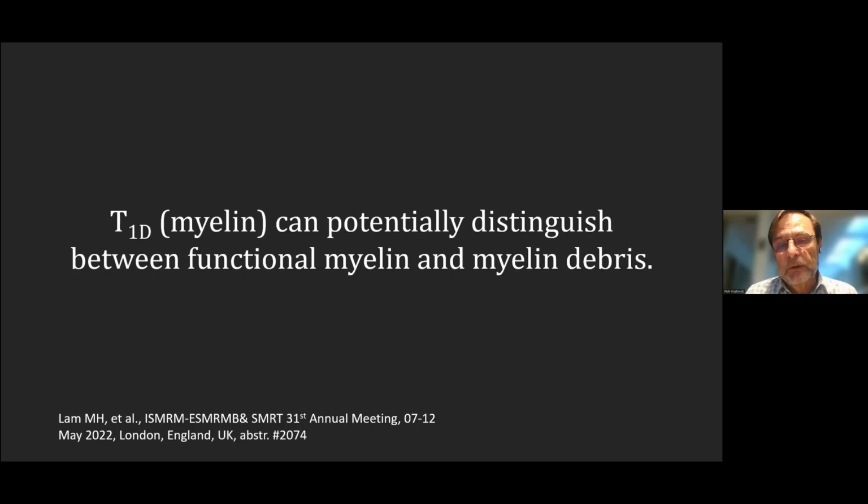It was a small study because it was done during the COVID, so there were some restrictions with regards to doing experiments. So right now we have another student who's working on a similar study with a larger number of cohorts, and it will be done at 9.4 Tesla, with the cryoprobe, so we expect to have much higher SNR for this study.